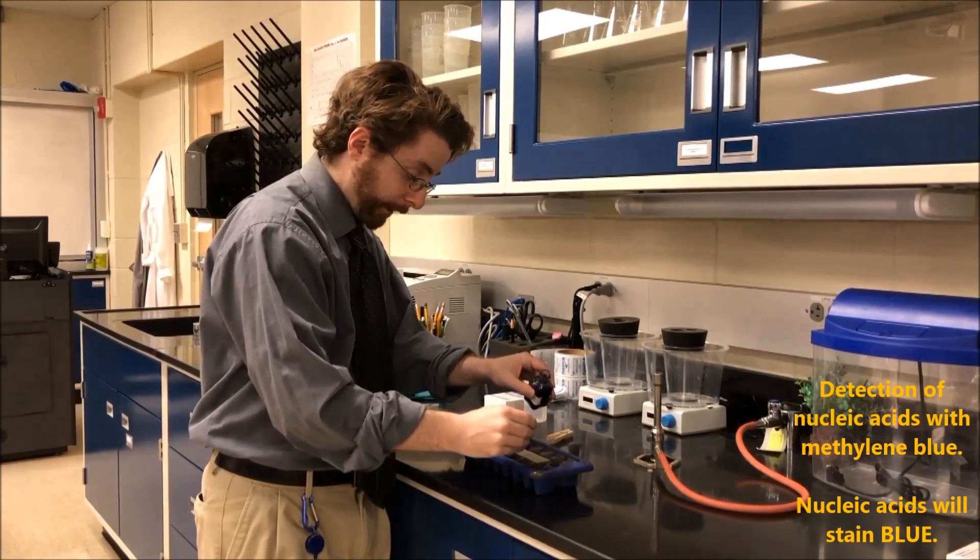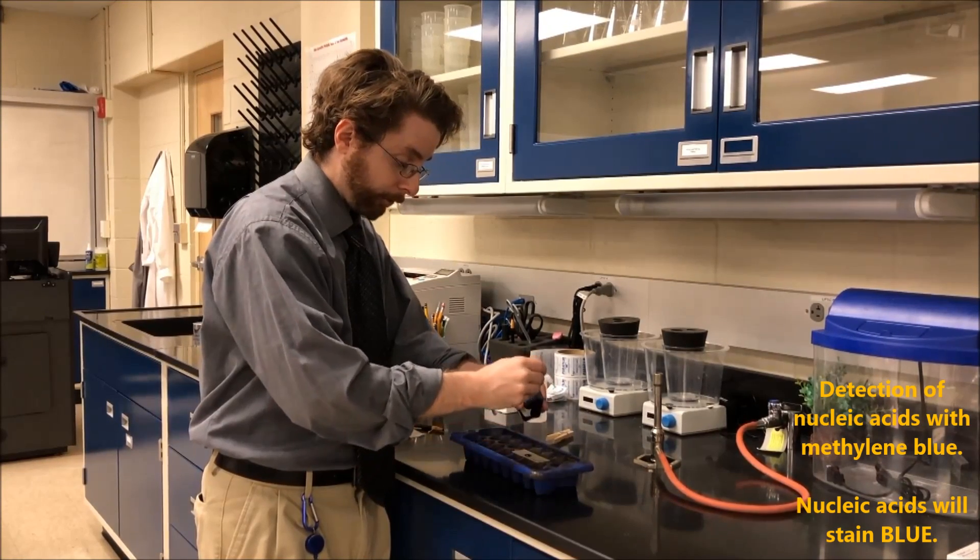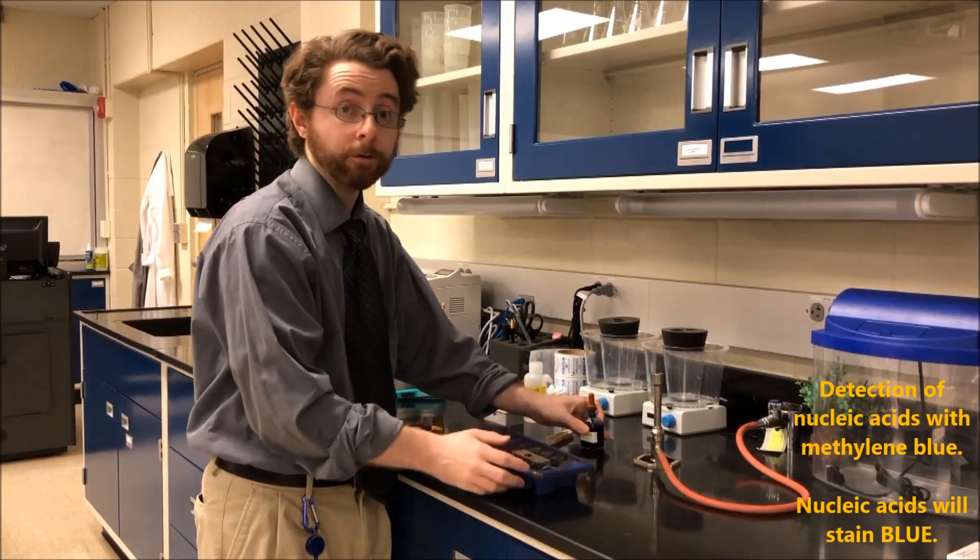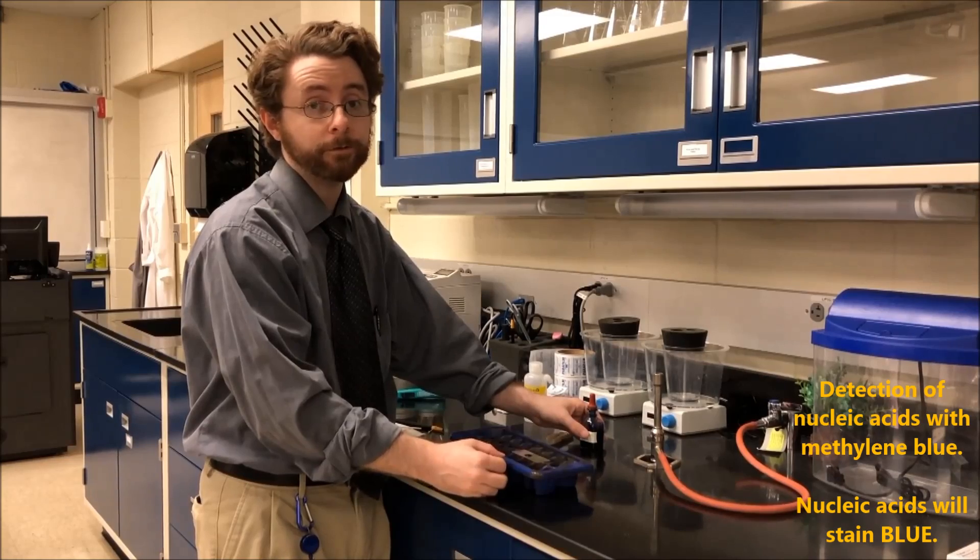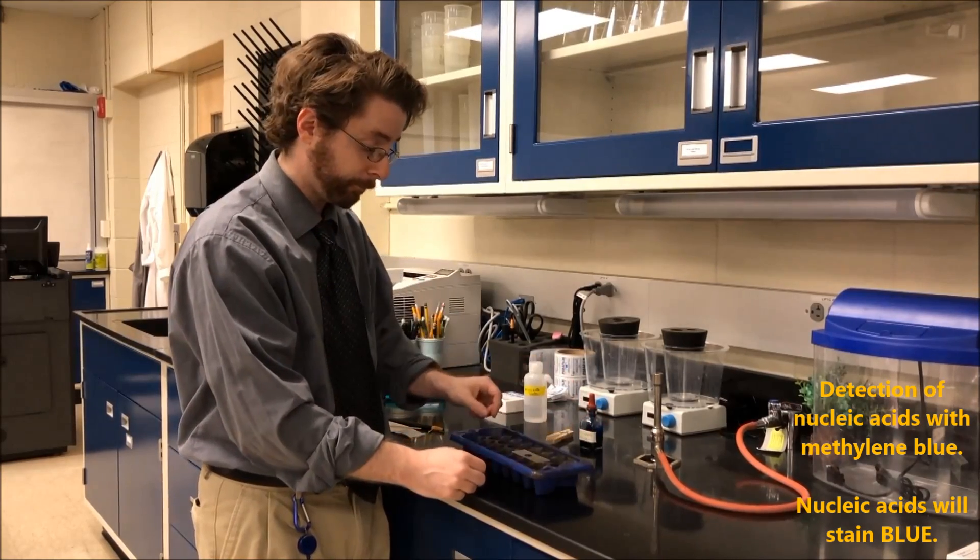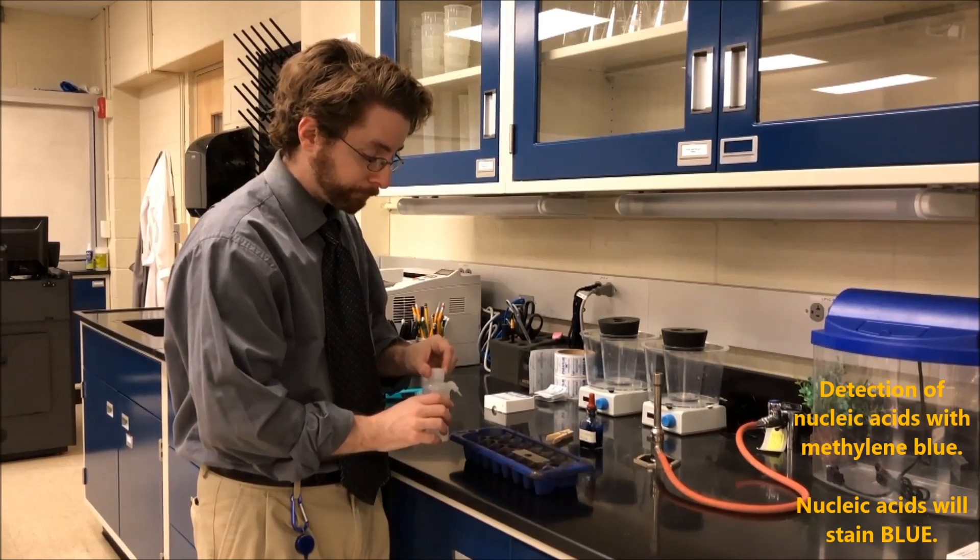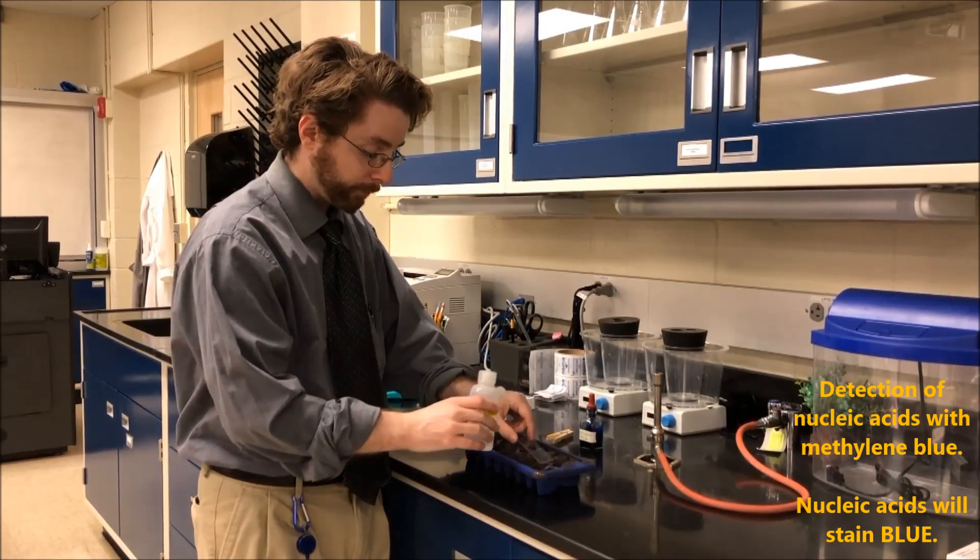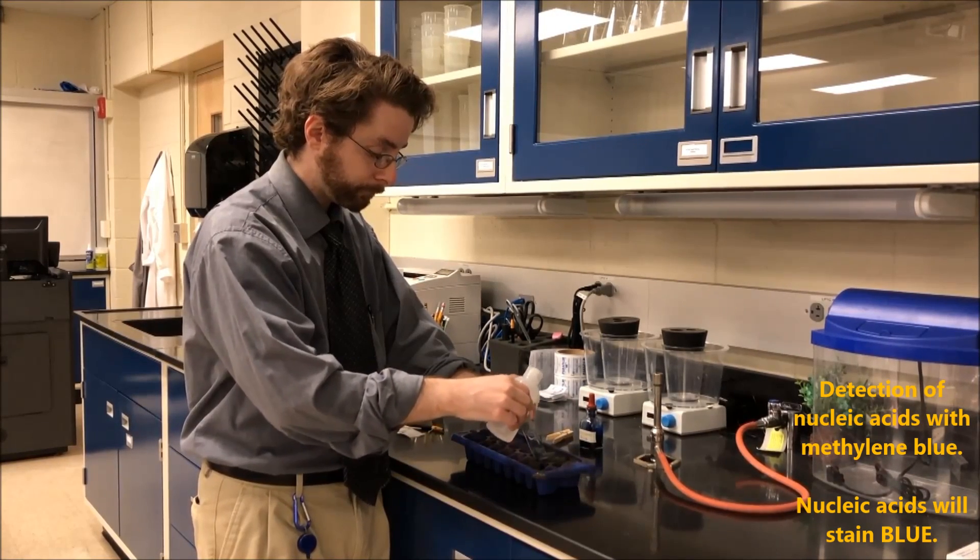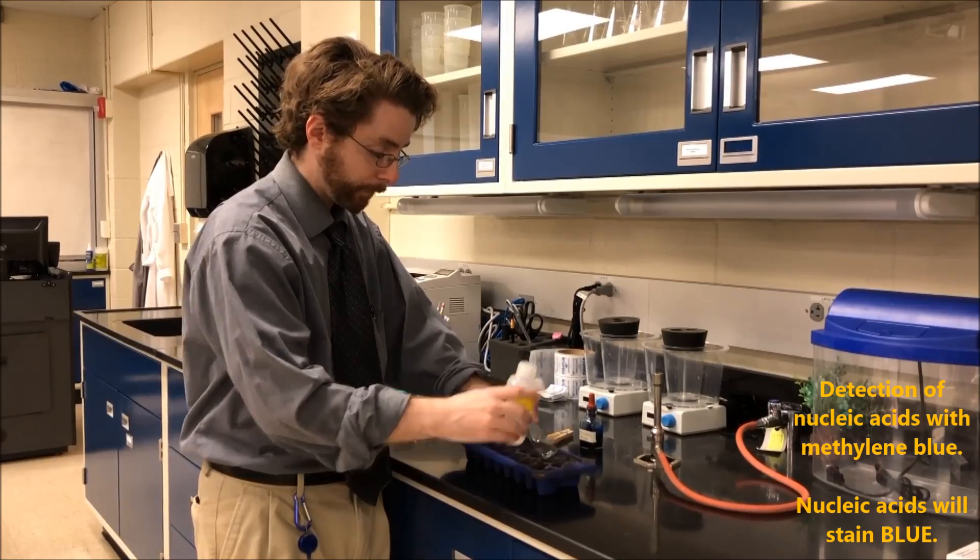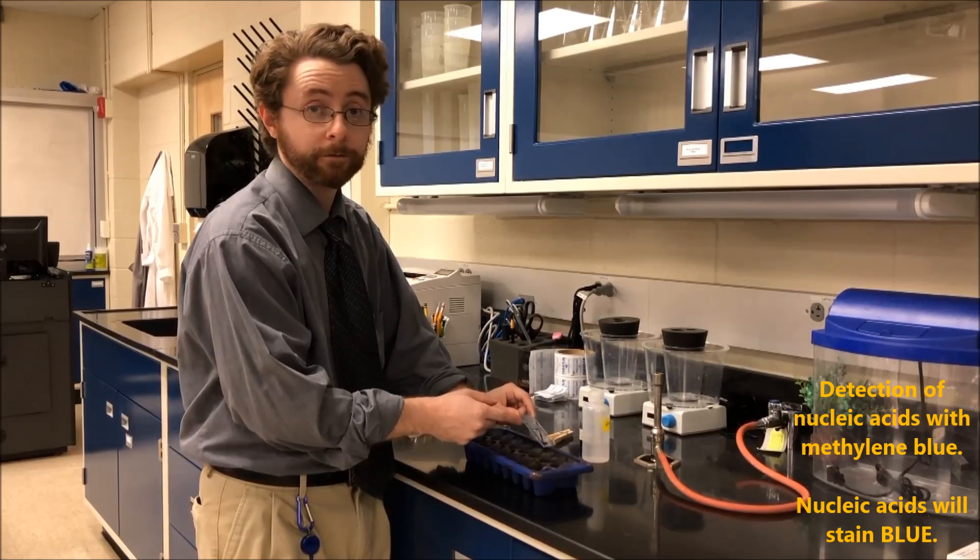So methylene blue, again, stains for nucleic acids like DNA. So when I look at my cheek cells, the nucleus of my cell should be stained blue because DNA is found in the nucleus of eukaryotic cells. We let the stain sit for a moment, and then we rinse with some deionized water. Tap off the excess. And then we can look at the cells using the microscope.